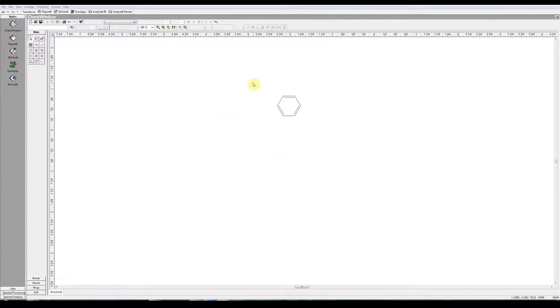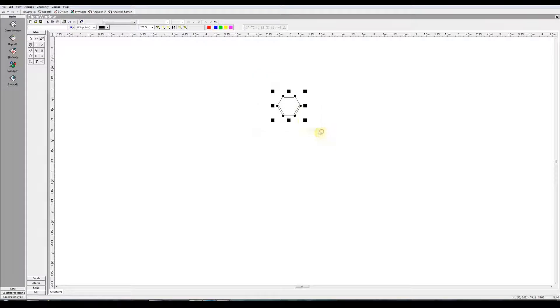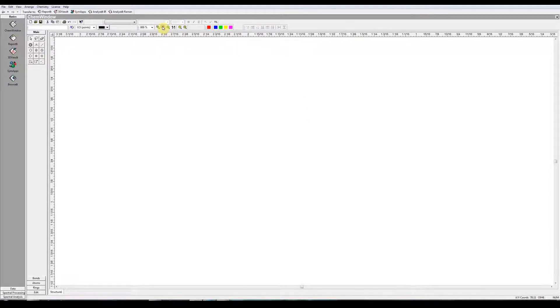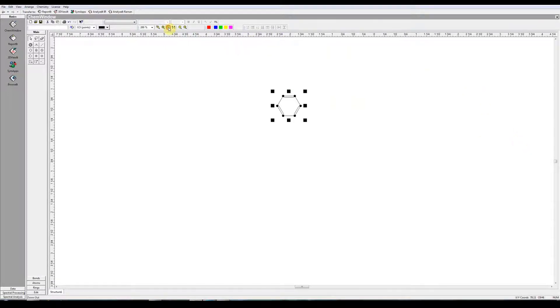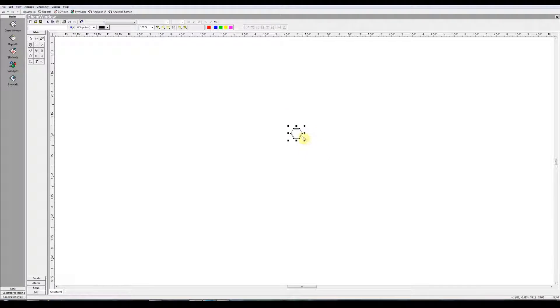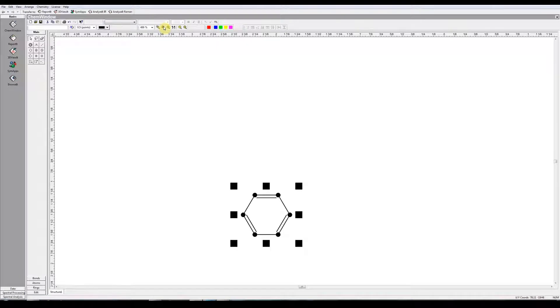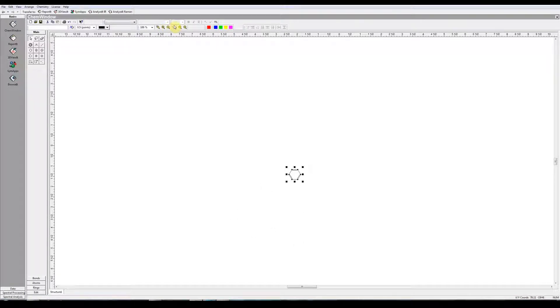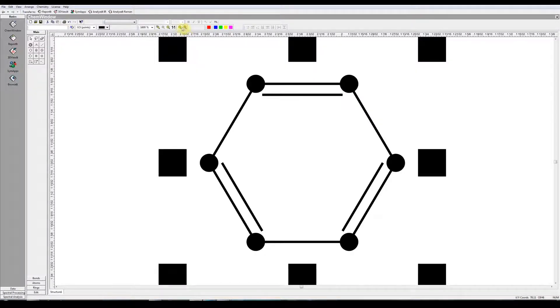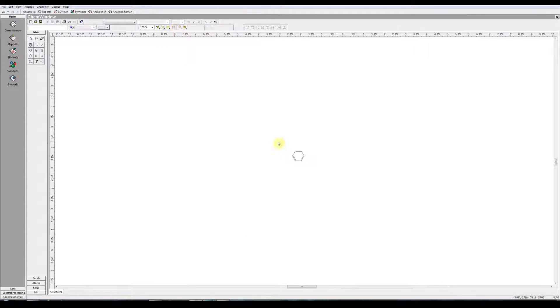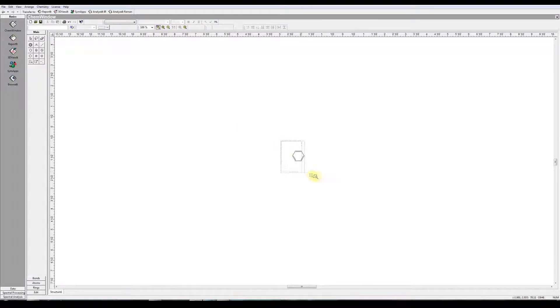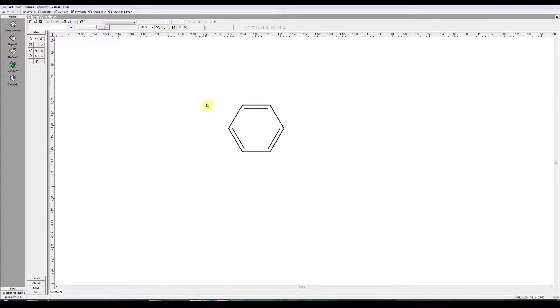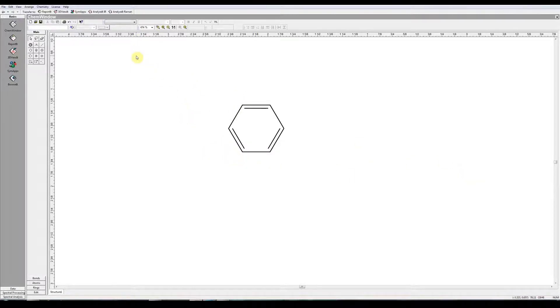If you select the structure, choose the selection tool and drag a box around it, these hitboxes are visible. Now you can choose any of these magnification tools. You can choose a one-to-one size. This tool allows you to zoom whatever you select. So these are quite useful. You can also change magnification size here. I find this canvas is awkward to use, easy to get lost in, but I guess it just takes practice.